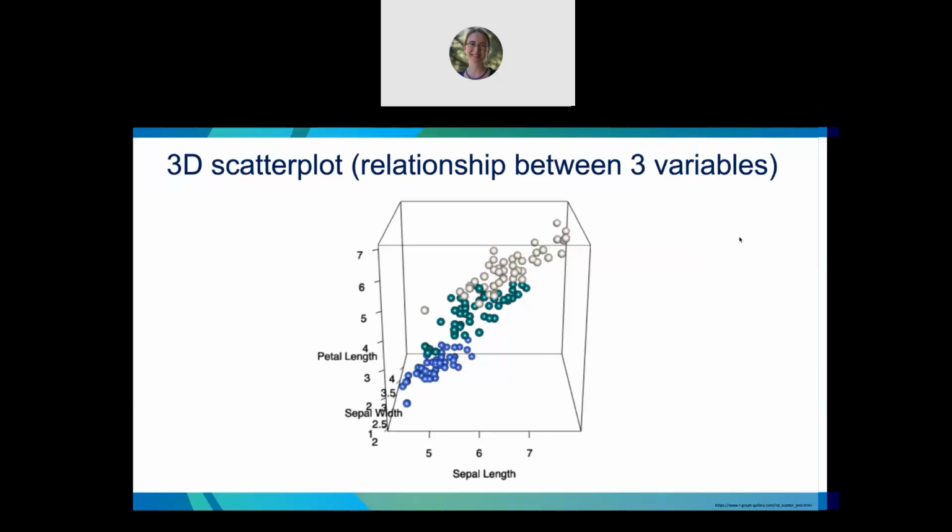So imagine that's not a plot. Imagine you come over to my house and I've got this fish tank, and instead of fish in the tank, I've got these dots. And the tank is totally made of glass. You can walk around it and look at it from any point of view. What point of view is going to be most useful for you to understand the patterns in this data? And bear in mind, you can't perceive 3 dimensions. You've just got flat backs of your eyeballs, so you can only see a 2-dimensional picture. But what's the best 2D picture? What's the best angle of sight that's going to tell you what's going on?